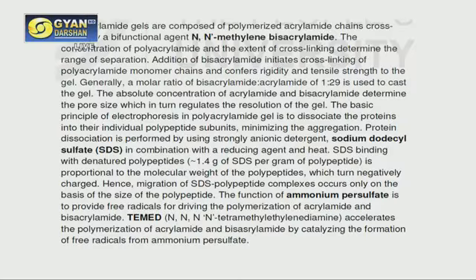And this SDS is used in combination with a reducing agent and heat. So SDS binds to denatured polypeptides, 1.4 gram of SDS per gram of polypeptide, proportional to the molecular weight of the polypeptides, which turn negatively charged. So this SDS has a particular stoichiometry in which it can bind to the protein.